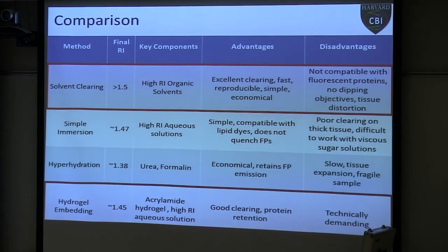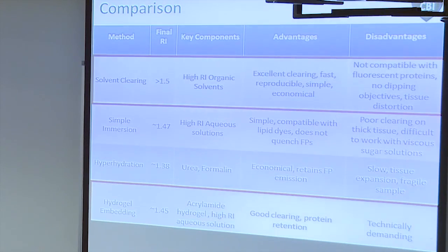Okay. But I think these two, the CLARITY techniques and the DISCO techniques, are really emerging as the two options out there, the two best options. And I think that's what's going to continue to evolve. These guys just need to find the right solvent that isn't toxic and isn't going to damage your microscope, and it's going to be perfect. I think the SWITCH technique, which is the latest evolution of CLARITY, also has a lot of potential as well.